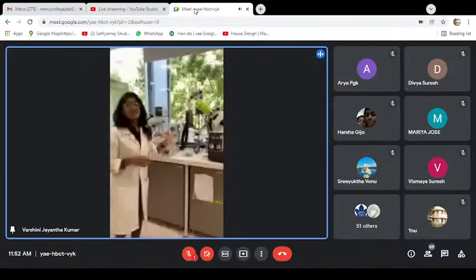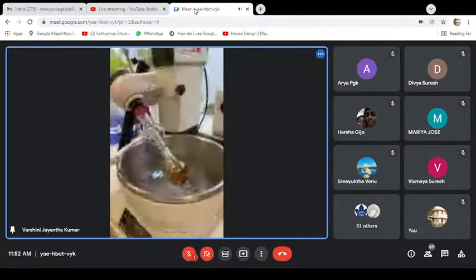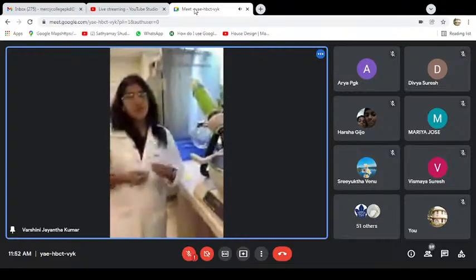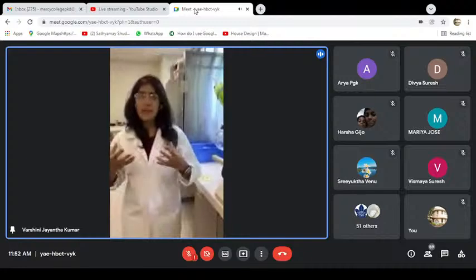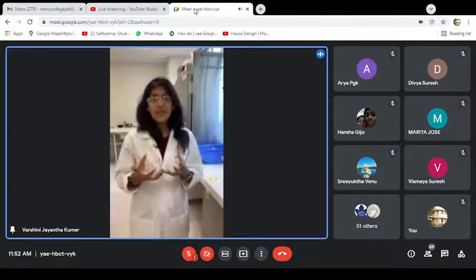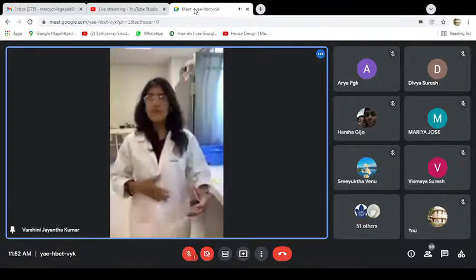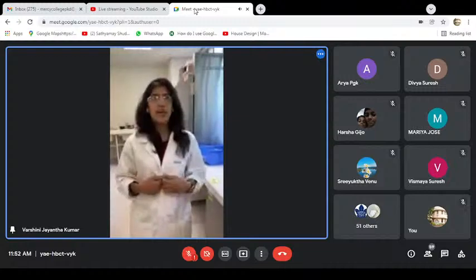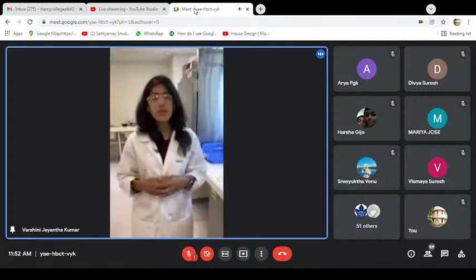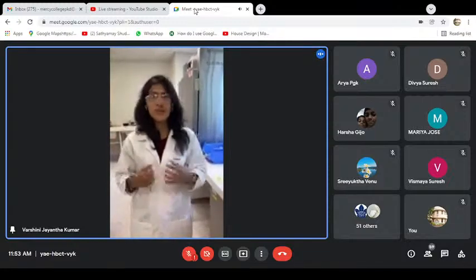And this is known as a rotary evaporator. So when we do some reactions, we know that we dissolve the reagents in a particular solvent. So the reagents would react and become the product. But again, the product is still in the solvent, right? So if we need to get the product as solids, we need to remove the solvents. But for solvents such as hexane or toluene, the boiling point is quite high, say 70 degrees Celsius. So it's really hard to evaporate the solvents off to get the solid substance. So what do we do?